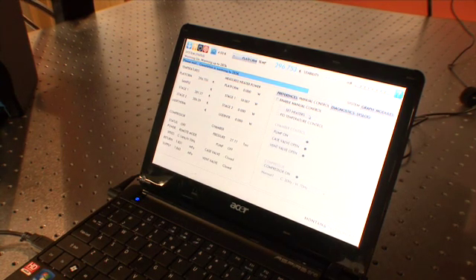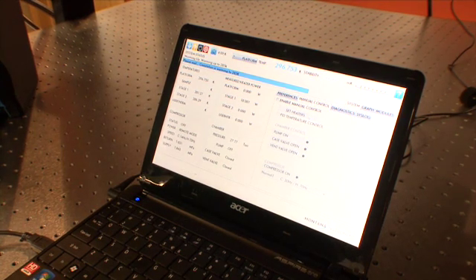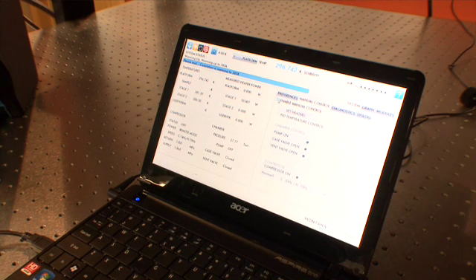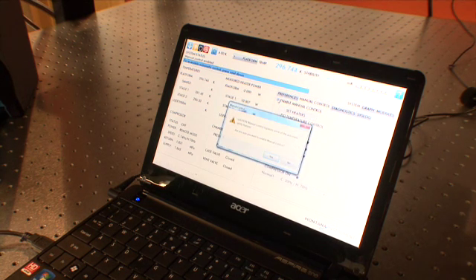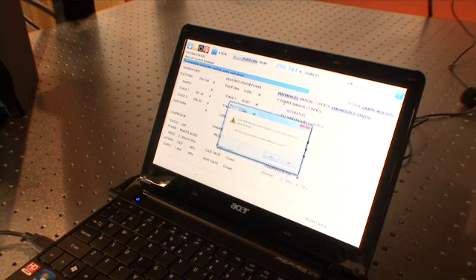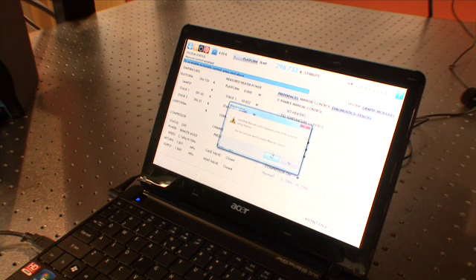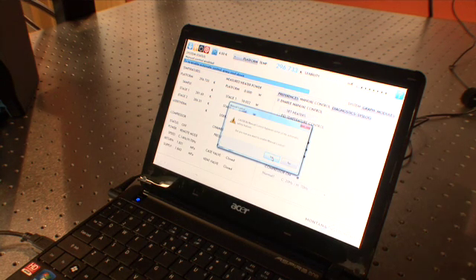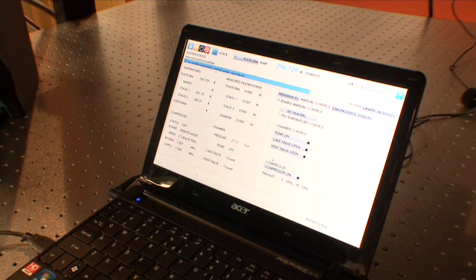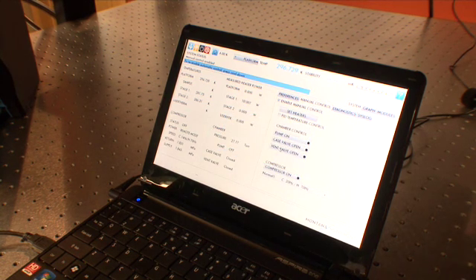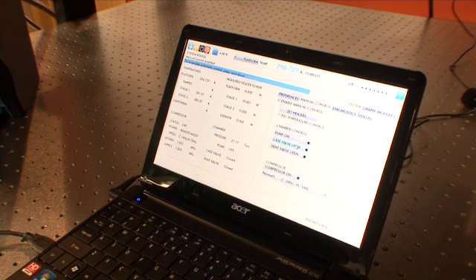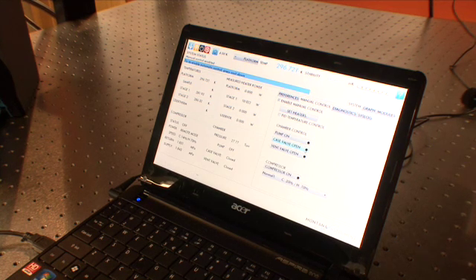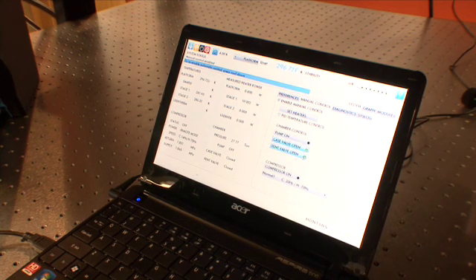You can manually vent the system by going into manual mode. Click enable manual mode and say that you're sure that you want to enable manual control. Then simply press the case valve open and the vent valve open.